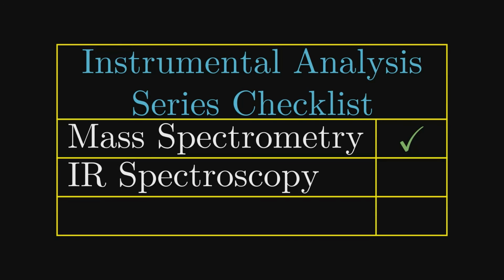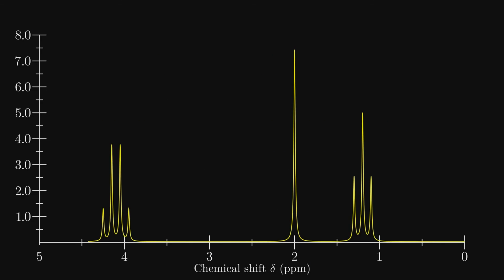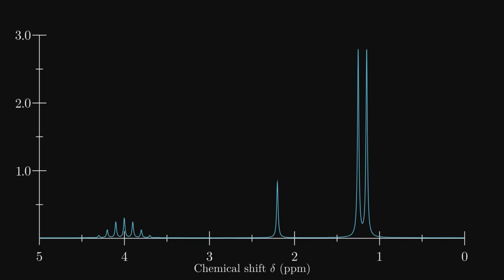And with that final problem complete, it is time for me to wrap up the instrumental analysis series for now. Yes, NMR is still on the distant horizon, though I will start sooner than I anticipate. If anyone can put in the comments what year the picture suggests, I will get around to it. However, even if none of you can figure it out, I'll probably do it anyway because someone helped me simulate the spectra and it's a lot of fun to mess around with.